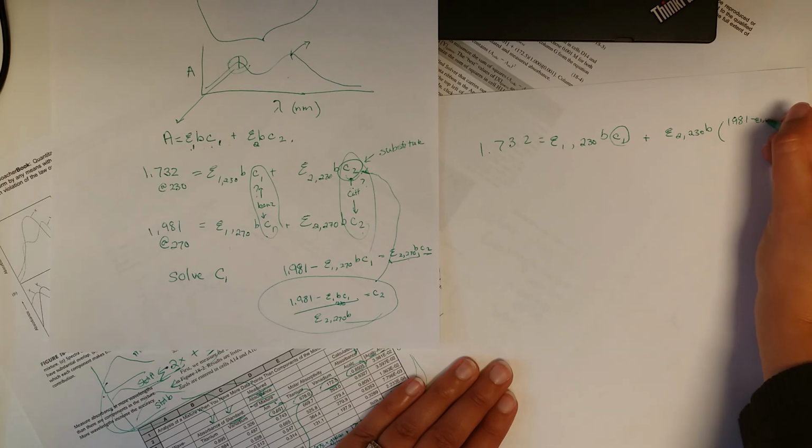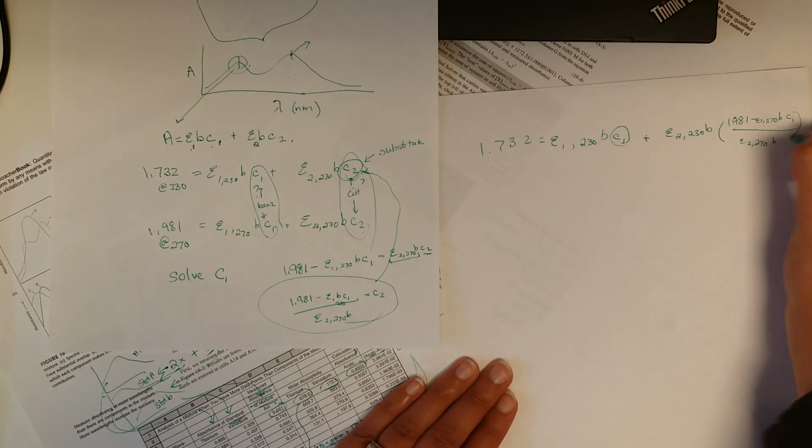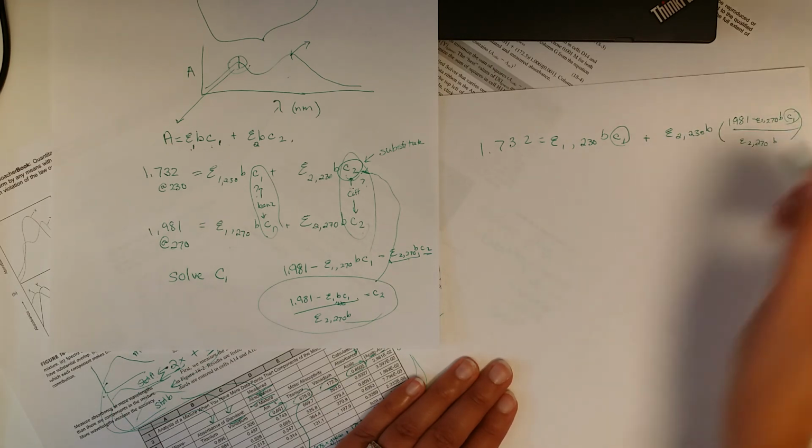And this isn't too bad because by now you actually have a number for path length, you have a number for your absorptivities, so a lot of these symbols go away and they're replaced by your numbers that you're used to. All right, one equation, one unknown, which is C1.